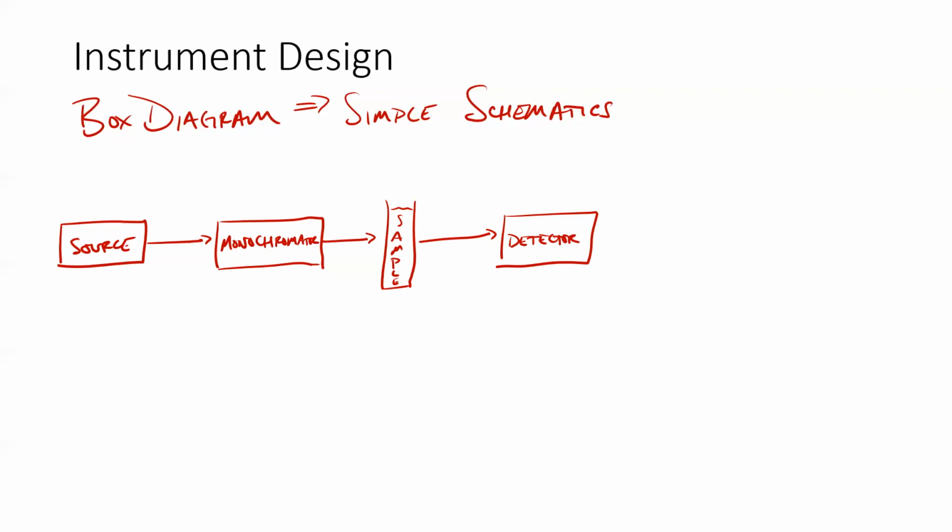I want to make sure that I match what our textbook has. I think it then gets processed by a computer or something, and our textbook calls this a signal processor.